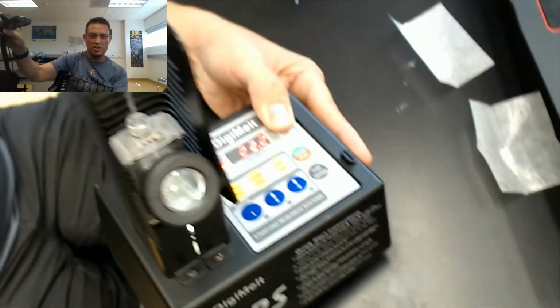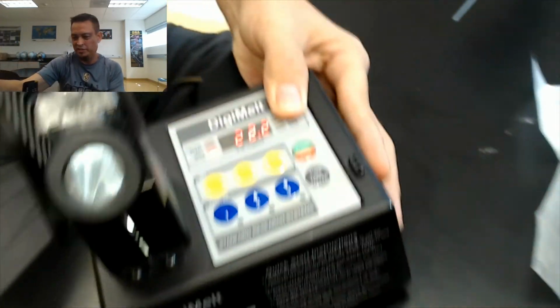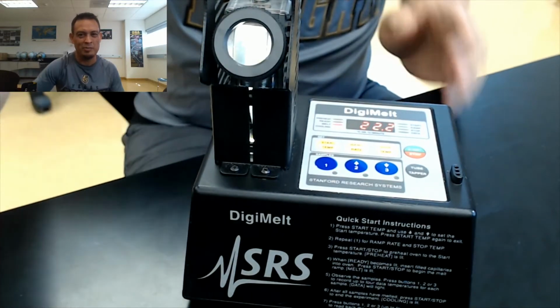All right, so after you have that, you're then ready for running the melting point apparatus. So let's go ahead and switch over to that. All right, so here is our melting point apparatus. So nothing really overly fancy here. It's pretty much just an aluminum block that has a controller, or aluminum block with a heating element in there.